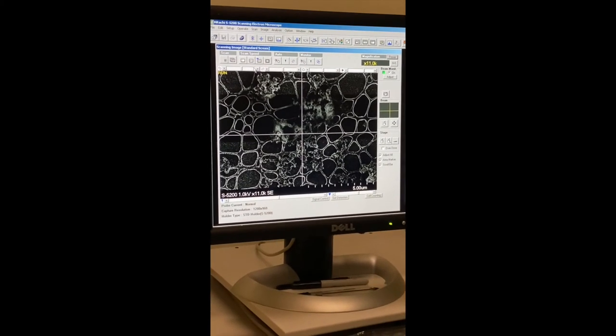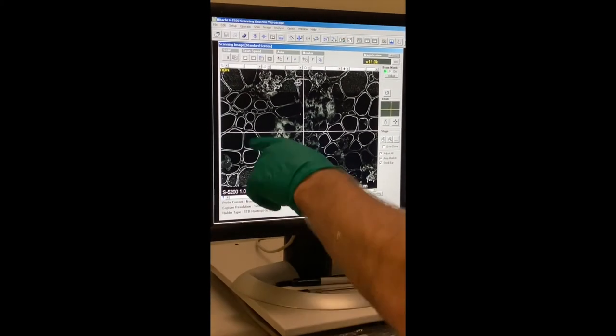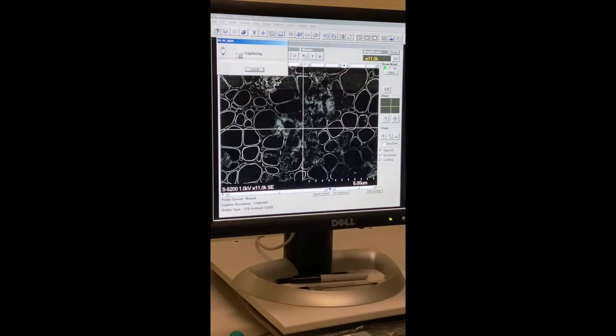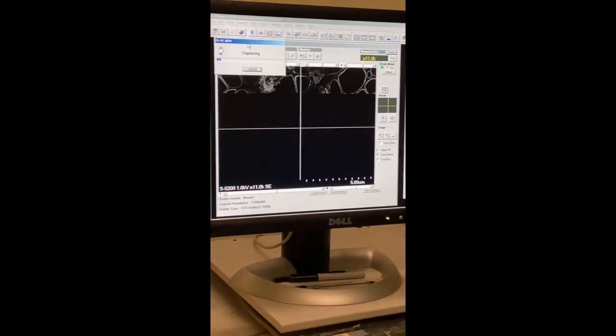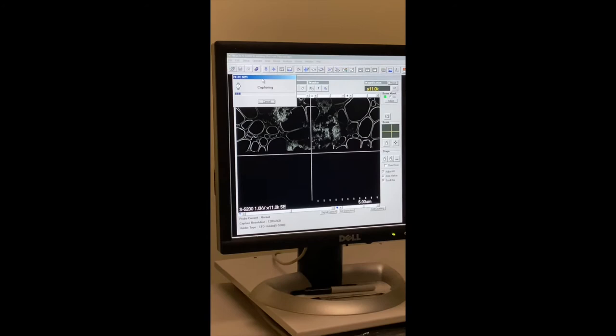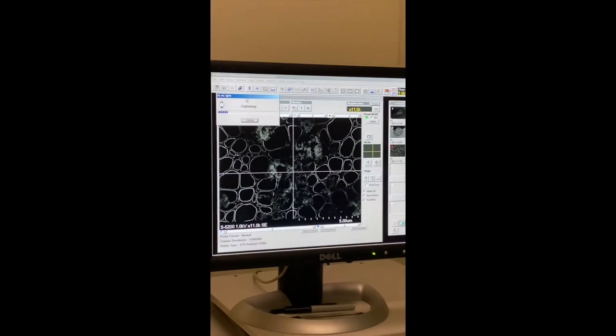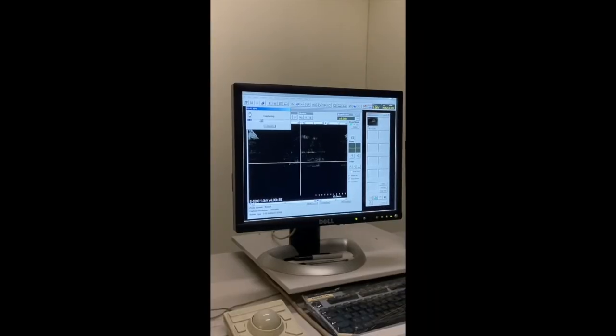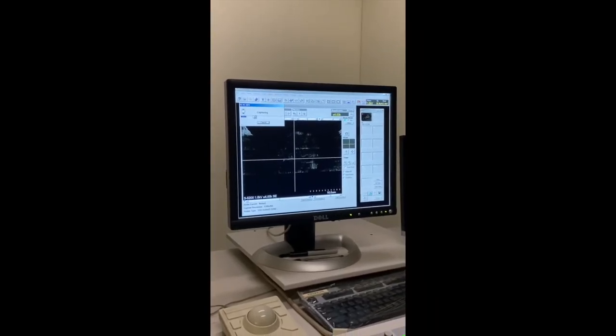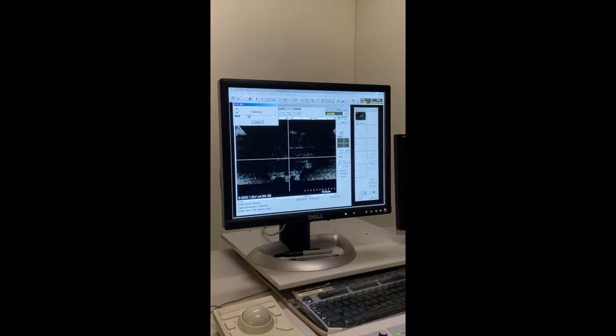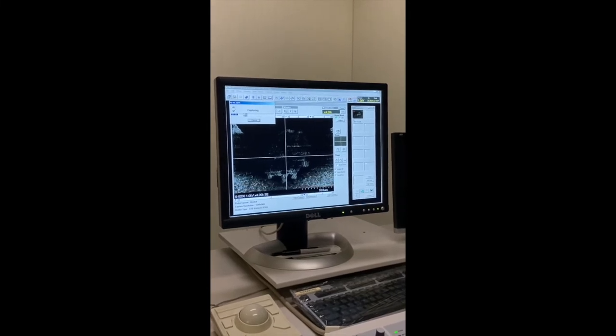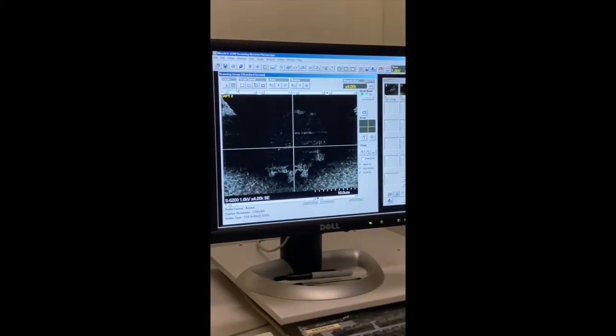And now that our sample is prepared and it's been loaded into the instrument and we've corrected for everything, we can finally take a picture. So let's do that. And what is this crappy image? So why, after all that work, did we get a crappy image?